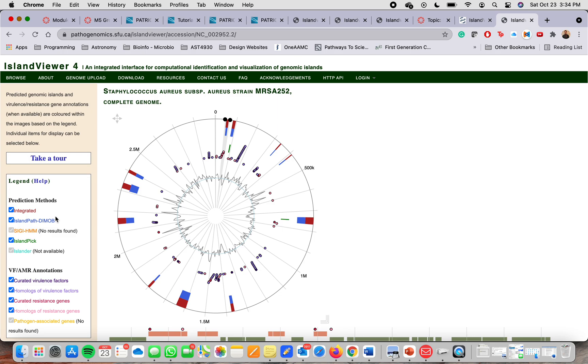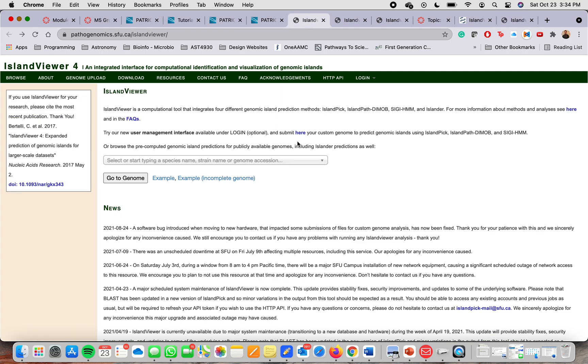Something that I didn't mention before is that this tool will use different prediction methods which provide different types of information. If you're interested in understanding what type of information, you can go here, it tells you.